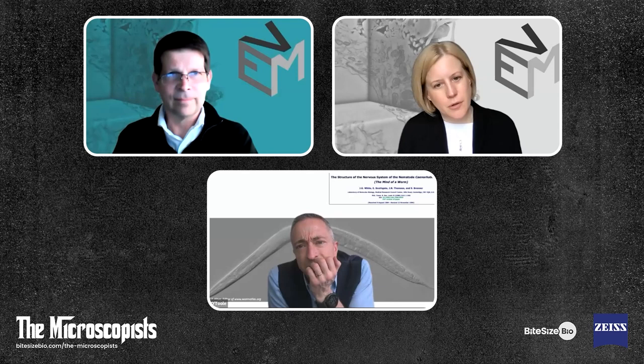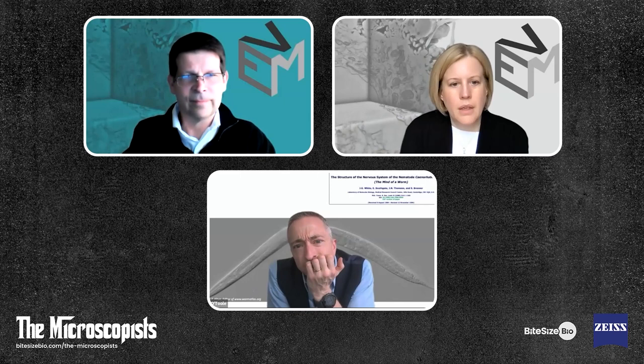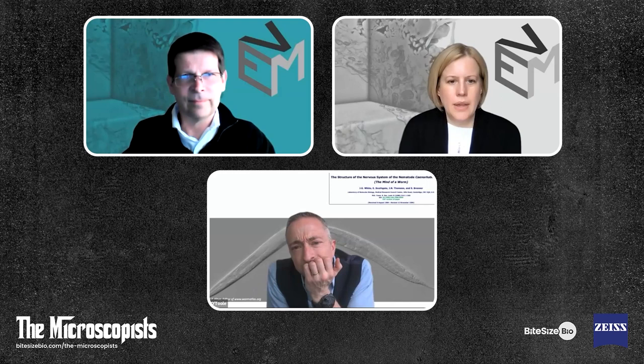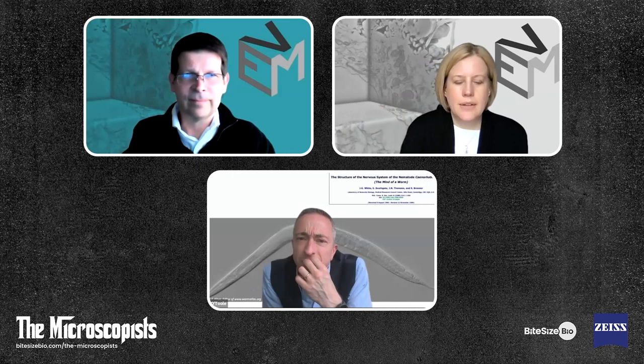Back in the 1980s, Sydney Brenner's team published the structure of the nervous system of the nematode C. elegans, otherwise known as the mind of the worm. I was lucky enough to go to New York to David Hall's lab at Albert Einstein and have a look at the original data that they collected. They went through the entire nervous system of the worm by collecting about 10,000 serial sections, and then imaging them one by one in the transmission electron microscope. If you lose even just a few sections during that effort, then you'll lose your connections through to the neurons. So in the end, it was an effort that took around 10 years.